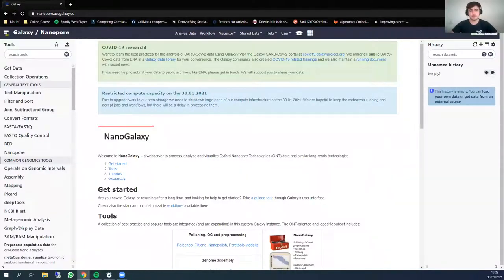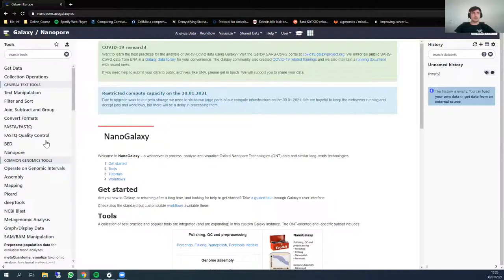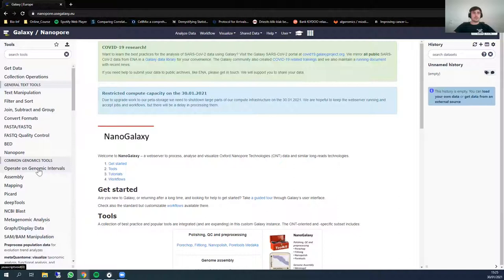Hi there everyone, my name is Wilhelm de Koning and in this video we will go through the tutorial for detection of antibiotic resistance genes with the use of nanopore sequencing data. In this tutorial we will use nanopore.usegalaxy.eu to perform all the steps because all the tools are available for nanopore sequencing analysis, but you are free to use your own instance, and all the tools are also available on usegalaxy.eu.